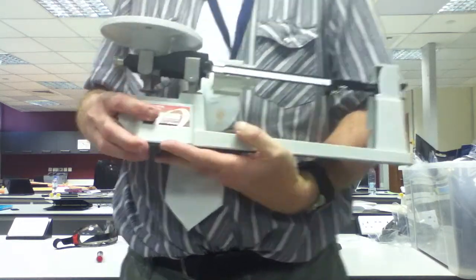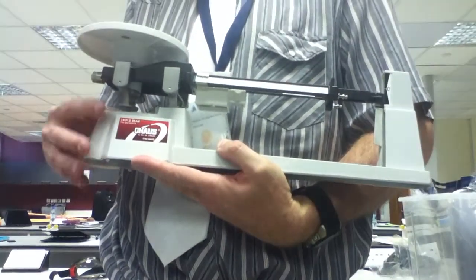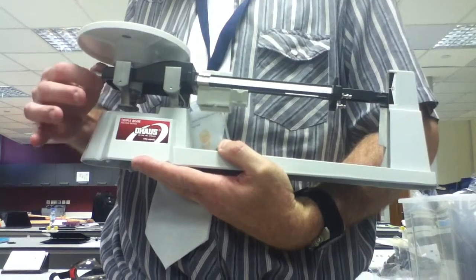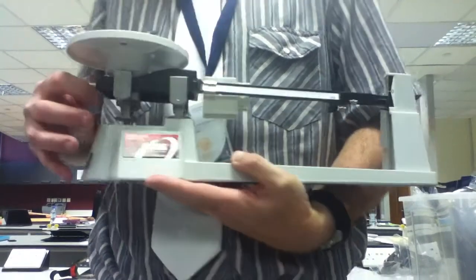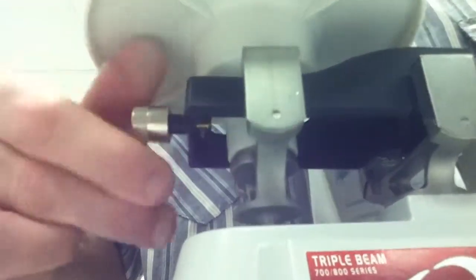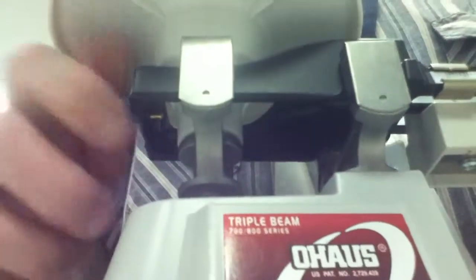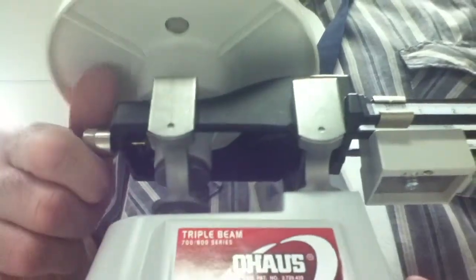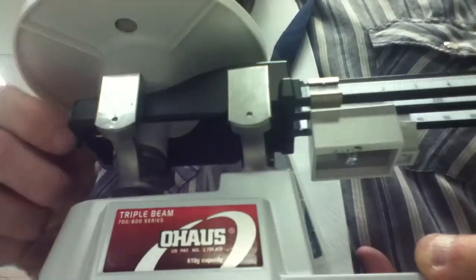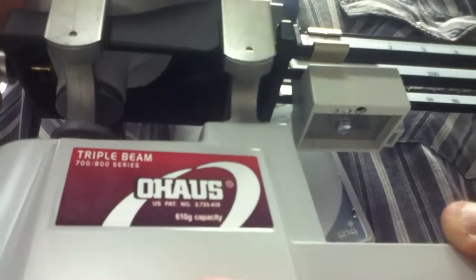It's going to be difficult to do this not on a table. But there's a little knob here. Can you see the little knob? If I turn it backwards, it comes out and makes it heavier. If you turn it in, it makes it lighter. That's how you adjust to make sure it's zeroed. You don't play with this knob at all. Understood?